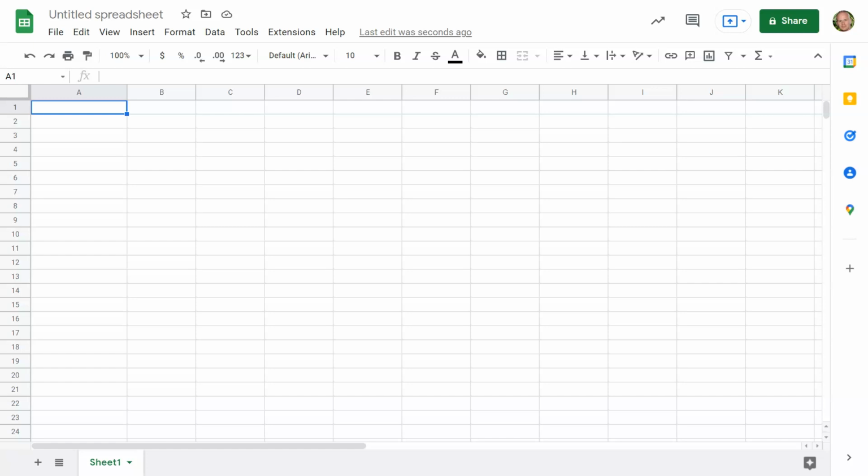In this video, we're going to do a titration curve using Google Sheets. Now, the data that I'm going to be using is sample data from a titration that I did with potassium hydroxide and hydrochloric acid. So, first thing I'm going to do, your first column is always your independent variable.